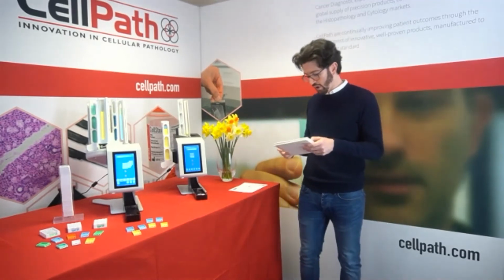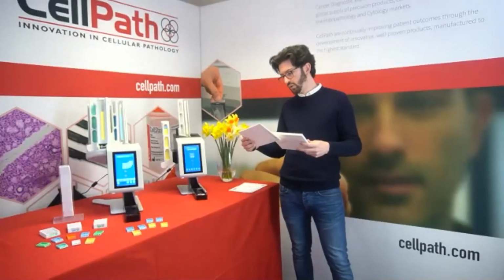Right, the next question I've got here is, does the printer have a list or memory of the print history? Yes, it does. The printer has the option to download the last 30 days' worth of use, and that will include things like what has been printed, when it was printed, and who printed it by the login of the user. This download is available in an Excel .csv file. So I hope that answers the question on memory of the printer.